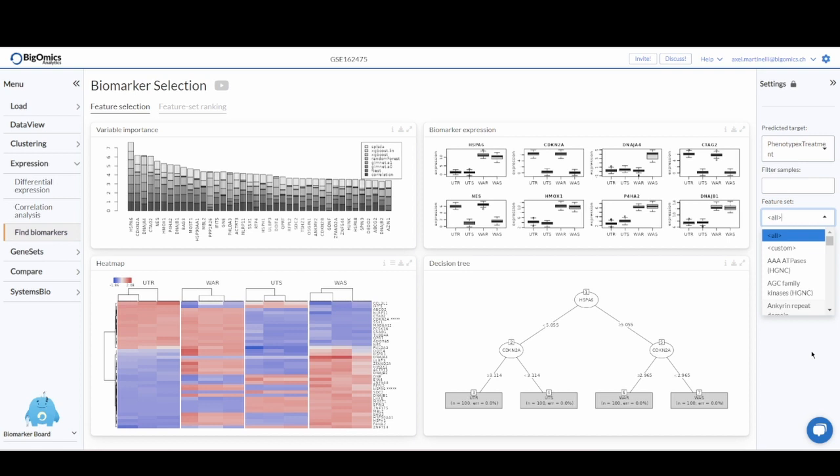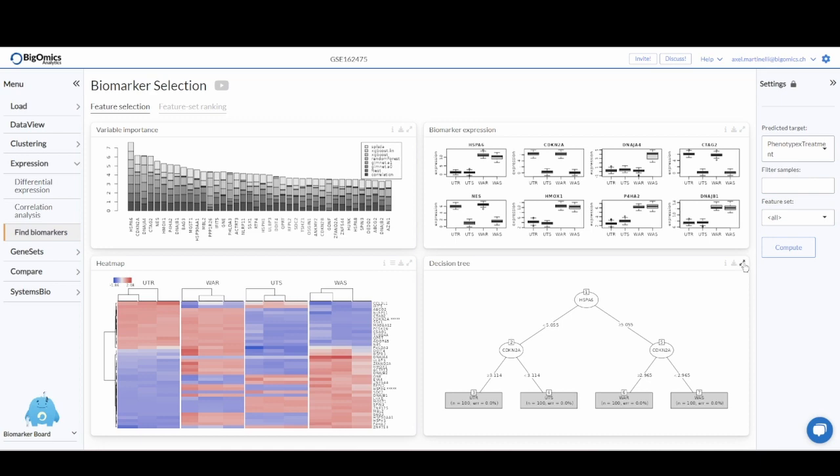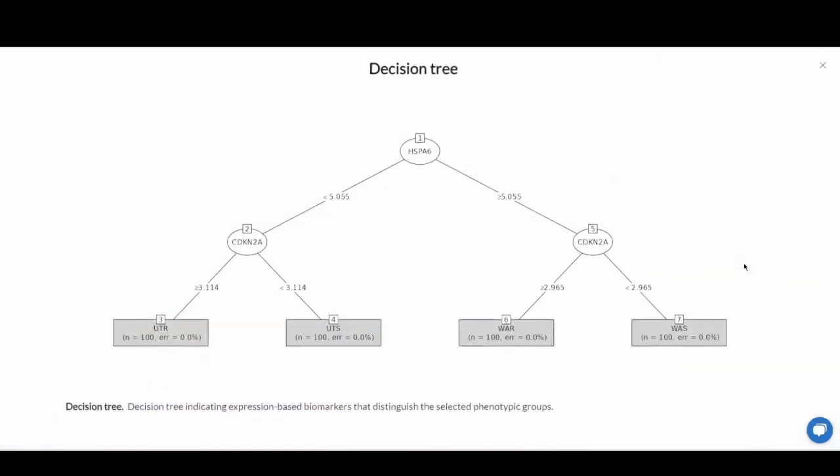As you can see, the platform generates four plots. We'll start a bit counter-intuitively from the bottom right, so we first of all have the decision tree that is produced based on the most likely biomarkers.